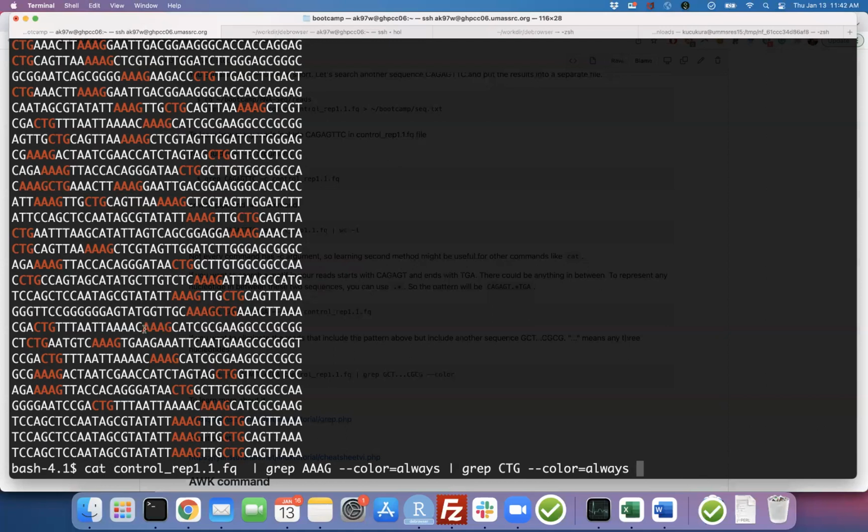You can give not only that one AG, but you can say in the first position, 70% A, 30% G, for example. You can give a matrix to the search algorithm with the percentages of A, G, C, T, and then you can even create a logo of the motif and search those specific motifs, including the percentages for the motif locations.